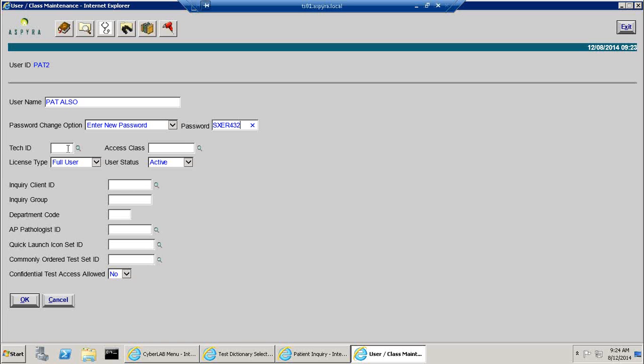And what the system will do is take the next in line that it made, starting with AA, and AB, AC, AD, AE, and so on, and it'll just take the next tech ID in line and go through all the tech IDs. And there are like 3,000 some odd different combinations that you can use between the uppercase letters and numbers, and I think they've even added a few characters that are possible.